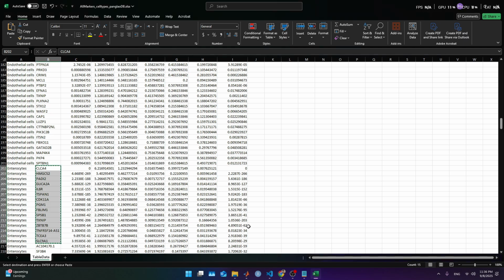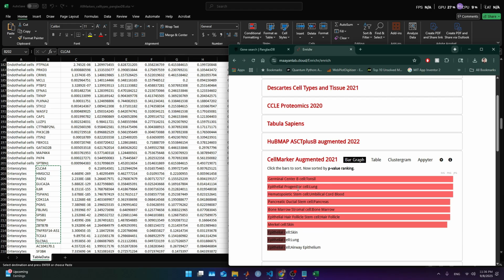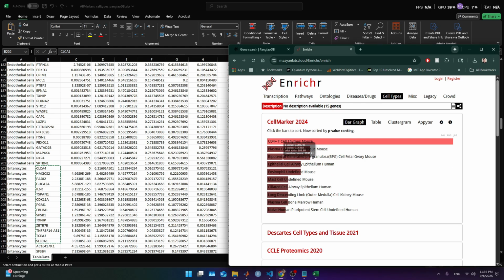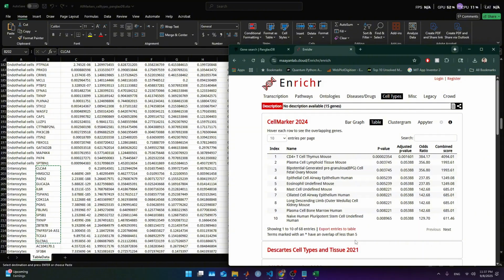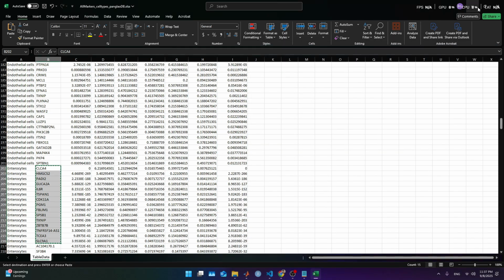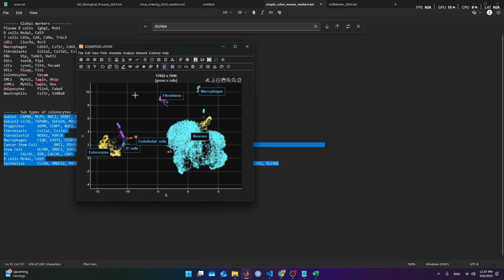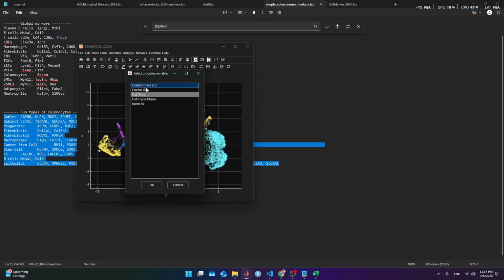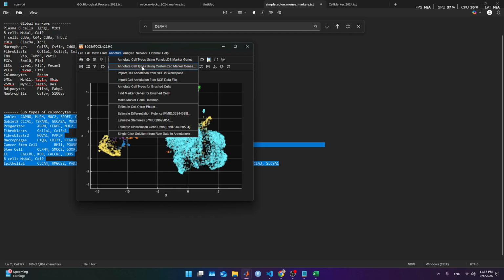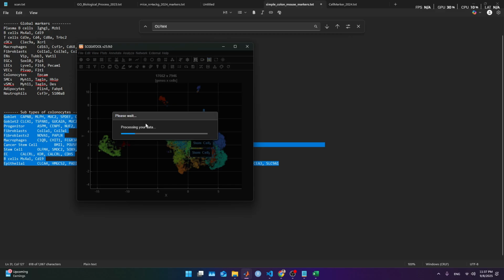Okay, after grabbing that and setting that into Enrichr, it points out that is epithelial in many places. Here in the augmented, and I think also here epithelial. That's not exactly our tissue, but I think it's lining up different epithelial, intestinal cell epithelium. So those genes here are good to use. And I formatted already, so we can utilize this final set and see how that performs. So we do cluster ID again and annotate automatically.